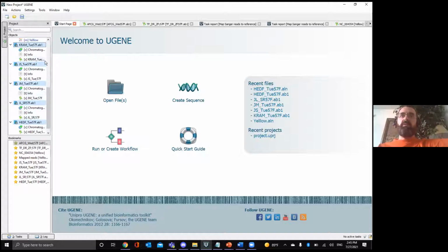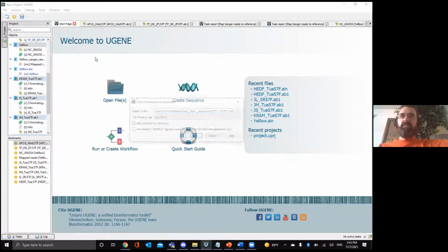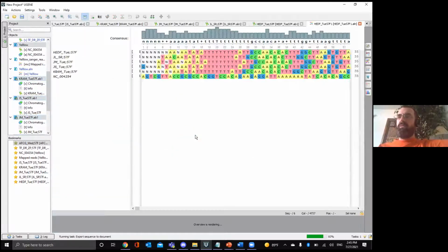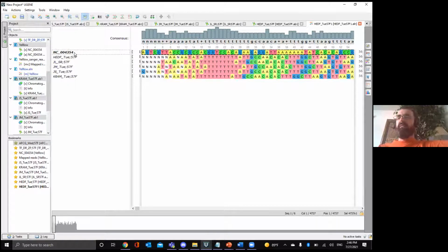That's it. You're good. Keep going up. You need to then select that yellow. Right click. Export sequences as alignment. Yep. You're gonna be a pro at this by the time you finish. No. Okay, now before anything else, I think this was me actually screwing you up by trying to be fancy. Select the NC sequence on the left, and then drag it up to the top. Okay, now do the editing. Shouldn't take you very long.